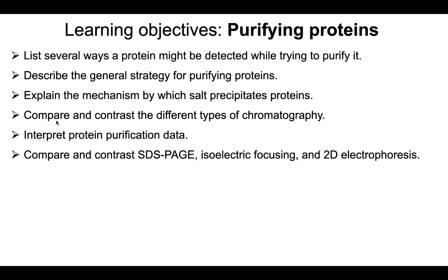I want you to be able to compare and contrast the different types of chromatography. I want you to be able to interpret protein purification data. And finally, I want you to compare and contrast SDS-PAGE, isoelectric focusing, and 2D electrophoresis.